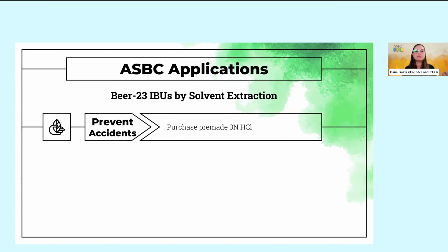pre-diluted stuff. And those are available on Weber Scientific and Thomas Scientific. And then that way, when those come in, you can add your bottle top right on top of it and never actually interact with the hydrochloric acid.